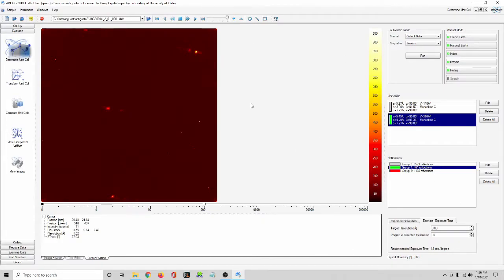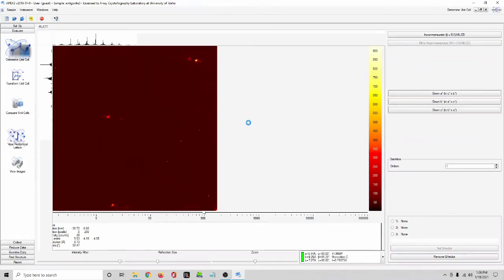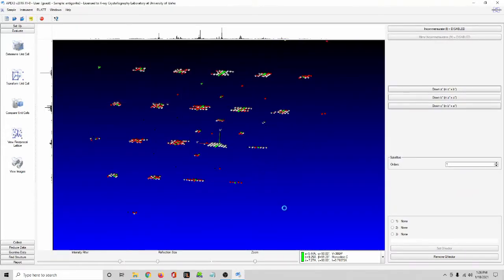That could take a lot of time going through different iterations of what I just did, but we figured it out eventually. And now the important step to not forget is to index the Q vector, which is our modulation direction in reciprocal space.